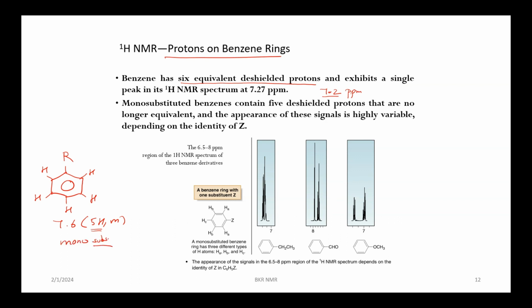Important clue: if the data gives a 4 hydrogen signal, that is 7.22, 2 hydrogens, and 6.92, 2 hydrogens, then in the aromatic region 4 hydrogens are left unsubstituted, which shows that 2 hydrogens are substituted. So it is a disubstituted benzene ring. Keep this in mind, very very important. Likewise, if you have 3 hydrogens giving signals, that shows the other 3 hydrogens are substituted, so it is trisubstituted.